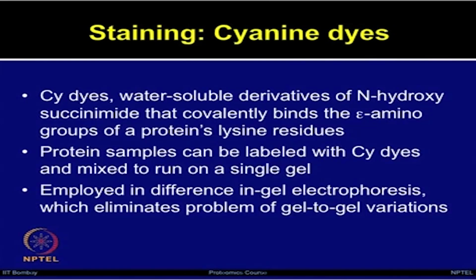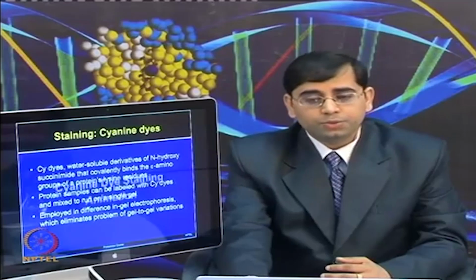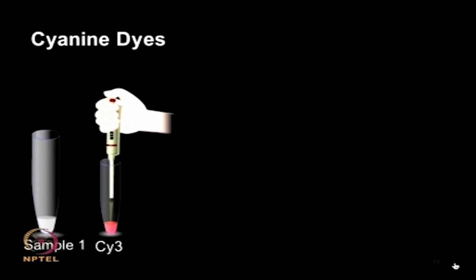I will describe this technique in much more detail in the latter part of the course, but briefly I will show you this animation for cyanine dye staining. Cyanine dyes. In this detection technique, the dyes are mixed with the samples prior to the electrophoresis.